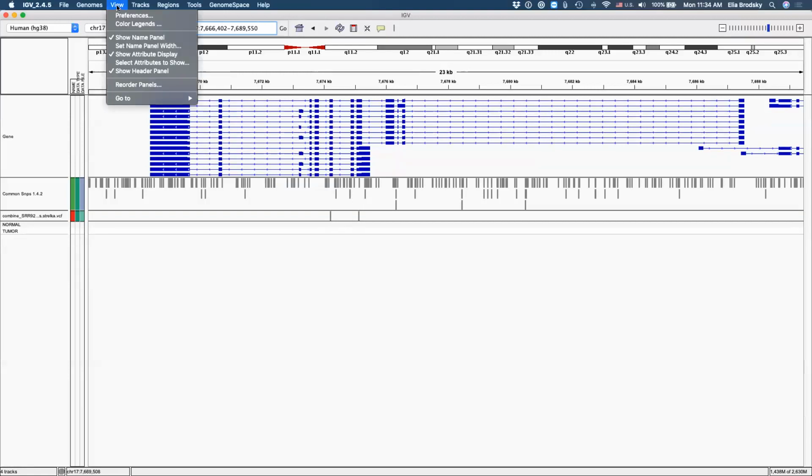And we will go, for example, into a place where we can look at just a number of genes, like 5 or 10 genes that are mostly interesting to us, because we think that's where the most suspected mutations could be found. Well, that's easy to do here. But you will also see that there's a lot more information in the data that could lead to different conclusions.